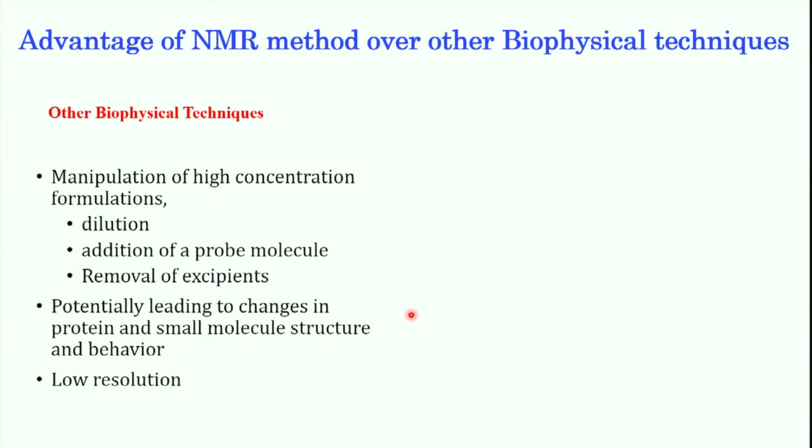Here we do not add any probe. We are not even removing excipients. Taking it as it is from the syringe, we record the NMR spectrum. So, that is a really great advantage. You are not perturbing your biosimilars or biologics when you record an NMR spectrum.